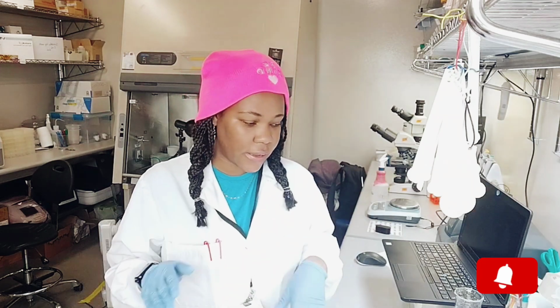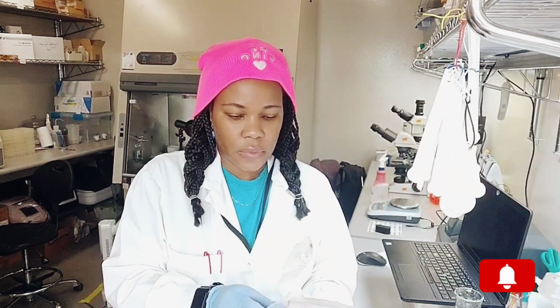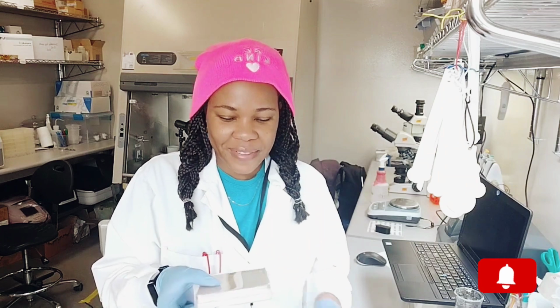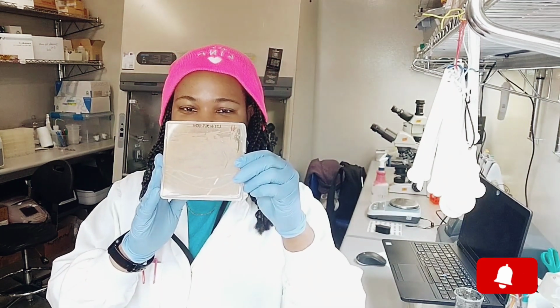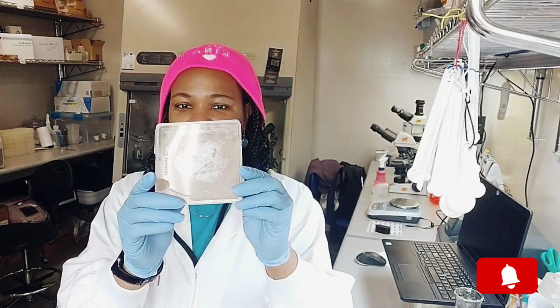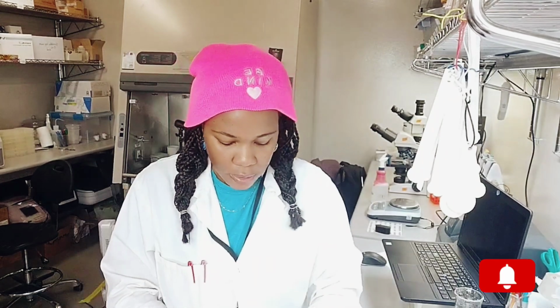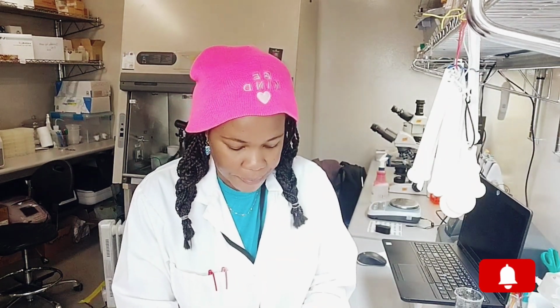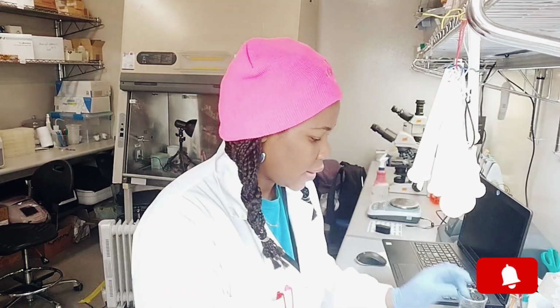I'm just going to grab all the things that I need for today, that I need in the BSC. So the plates. These are important bits. Oh, that's what they look like. Can't really see from here because of condensation, but I need the plates. I inoculated 12 of them. So I have them here.